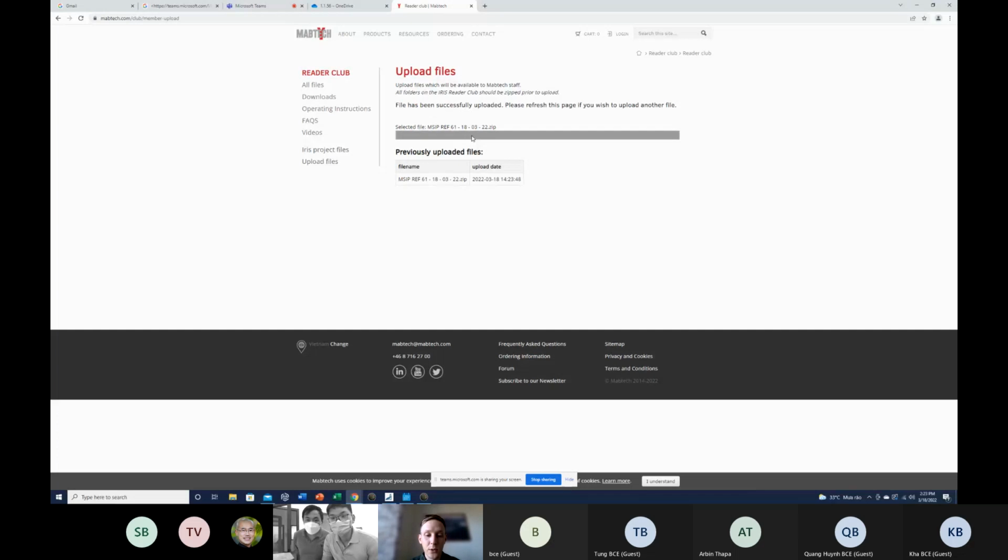Okay, then I'm just going to double check that the file has been uploaded to the Reader Club. Yes. And yeah, it was uploaded successfully. So Arbin is going to take a look at that and do the data analysis and everything. And when we have done it, then you're going to get information from us that everything passed, everything is okay.